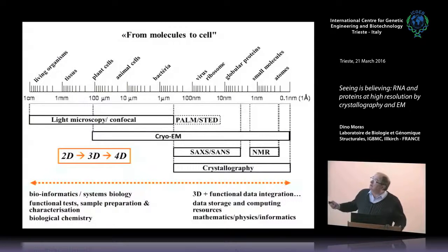And you have other techniques which are evolving: light microscopy, I will not talk about, and solution study, NMR also, but with NMR you focus on some specific things. You don't have the whole picture. You can argue about that, but that's it. And so you will see now structural biology is a combination, and structural biologists combine the sources of information from different sources. That's why we talk not about X-ray crystallography, we talk about integrative structural biology.